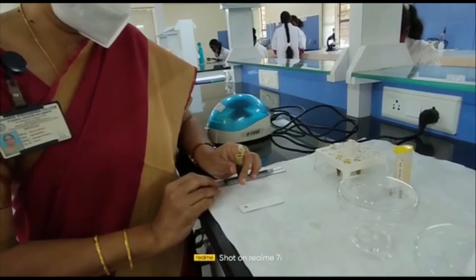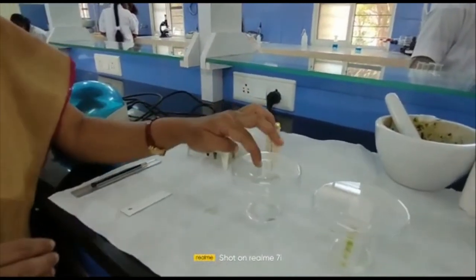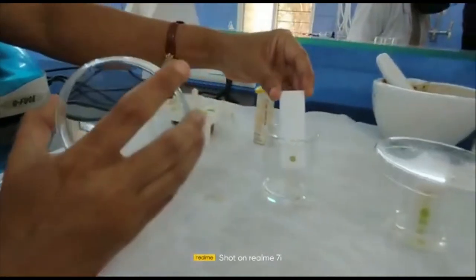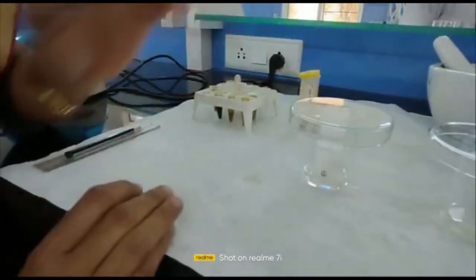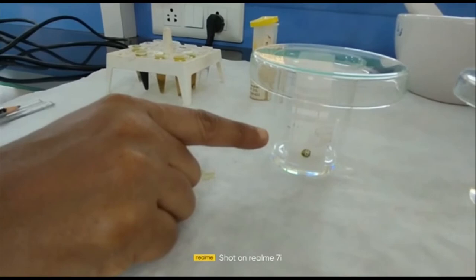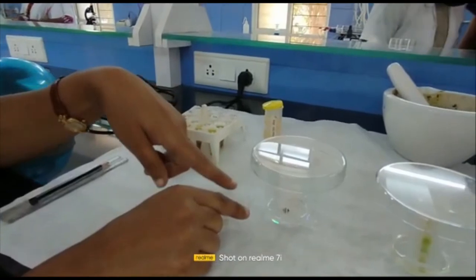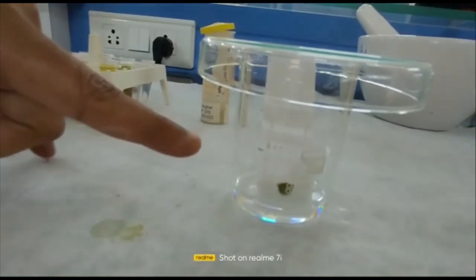The next step is to place the spotted TLC plate into the chamber saturated with the mobile phase. Hold one end of the TLC plate, open the chamber, and place it inside where we have the mobile phase — benzene and acetone in the ratio of 9:1. Always ensure that when placing the TLC plate inside the chamber, the spotted area must be above the mobile phase. You can now observe the mobile phase moving upward.